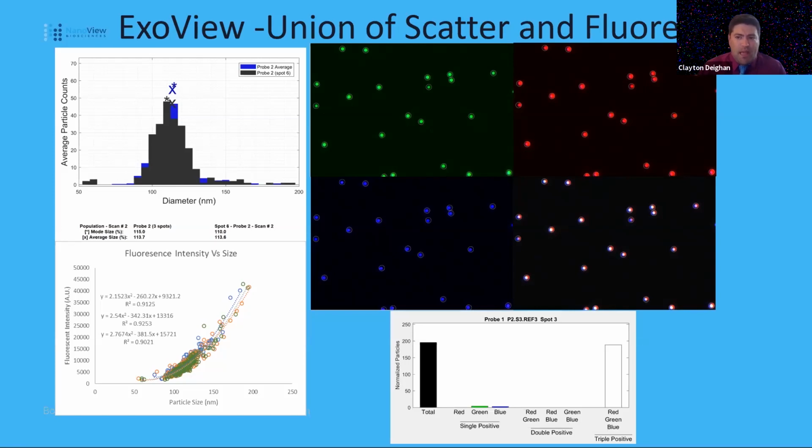And we're going to find that that phenotype, when we stain EVs or we look at EVs, is present, but quite rare often, and that our double staining and triple staining is a fraction of the different subpopulations. But it's important here to start at a control where the answer is all of the events that I've detected that have a size, and also the phenotype of all of those events is triple positive in the color channels.